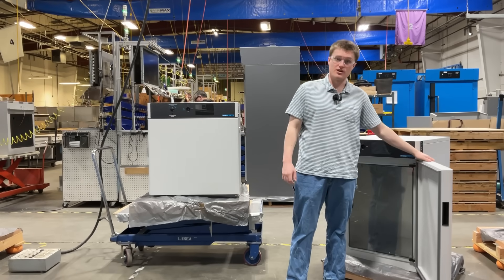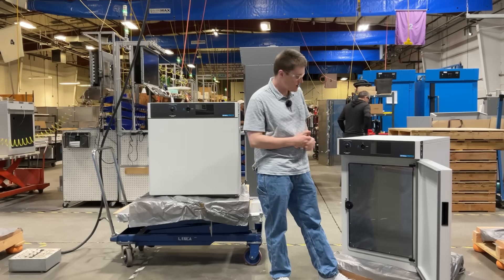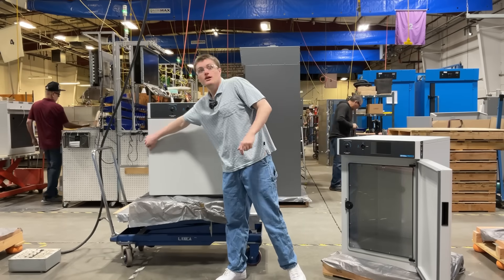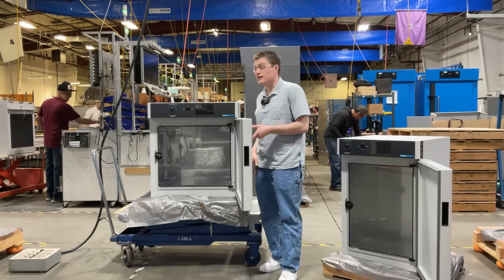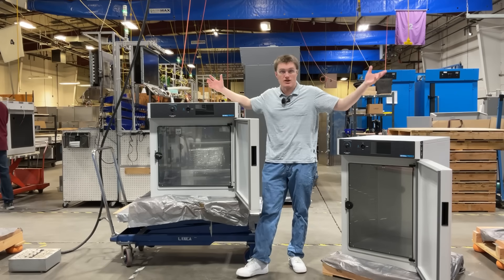The first thing you will notice is they both have a heated outer door as well as a tempered glass inner door. This allows the user to take a look inside the chamber and monitor their samples without actually opening up the chamber to the outside environment.